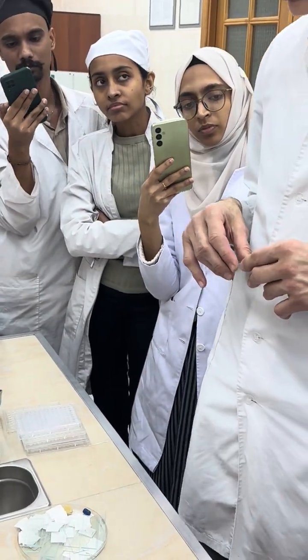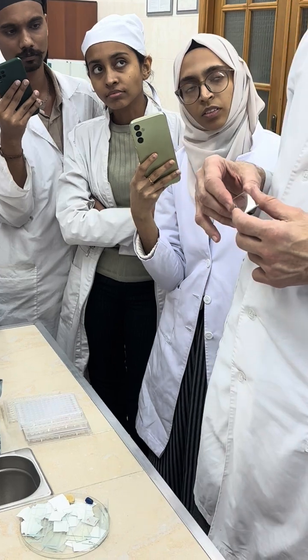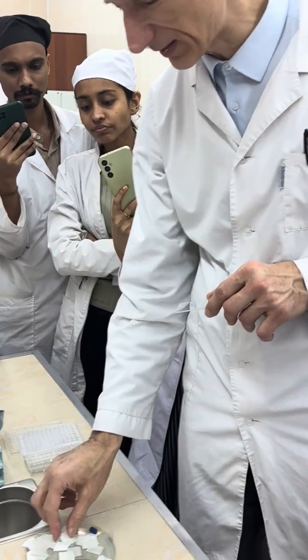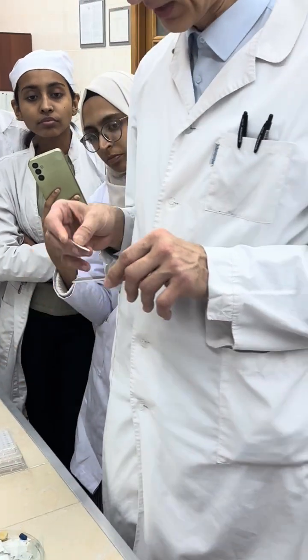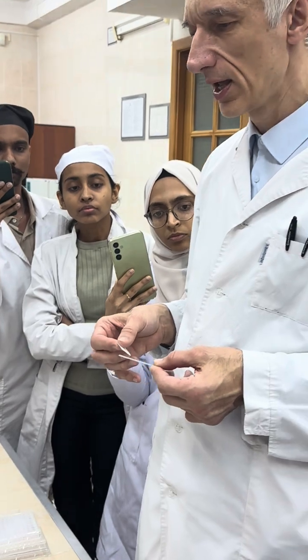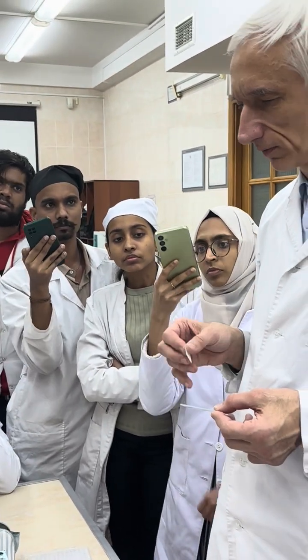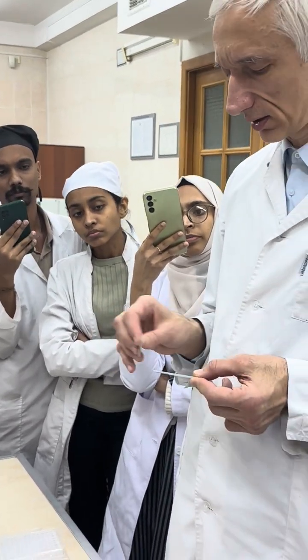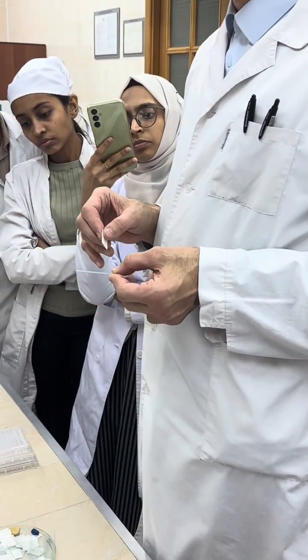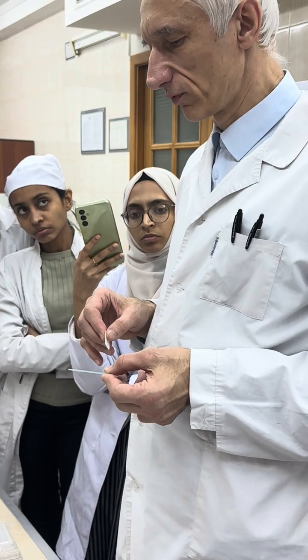So people, then treat with soap. I will not do that. Why do we use soap? To remove lipid impurities. As I recommend, once you have covered the area of your slide, perfectly remove the soap. Sometimes students want to finish earlier and they don't pay attention to that. Soap is, of course, a very ancient method of removal of lipids.